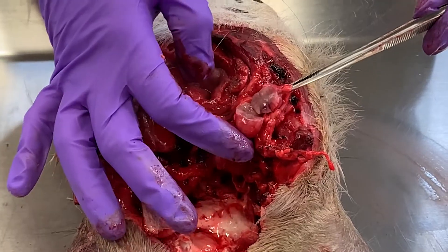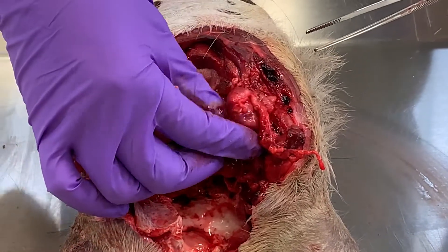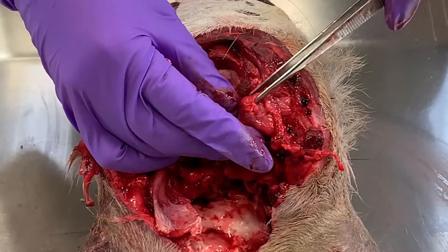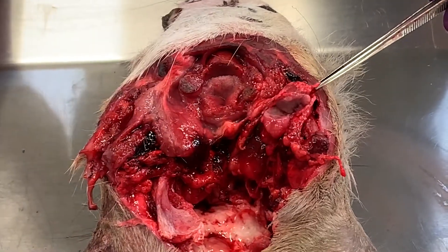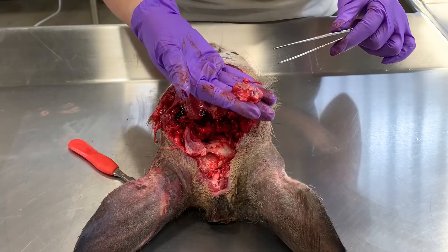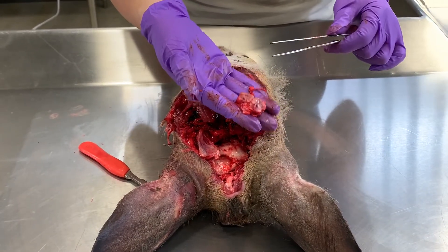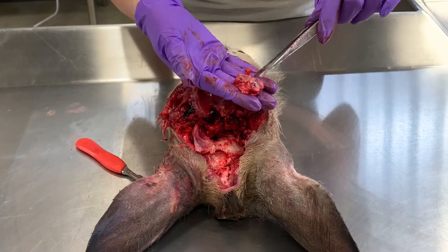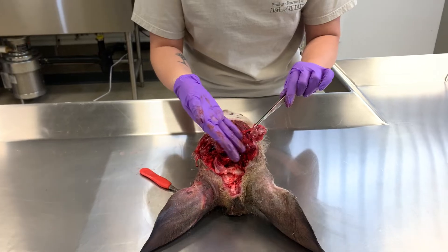The most important part is not that you keep this lymph node all together — the important part is that you get all of it. Before I cut it in half, it's kind of pea-shaped or kidney-shaped, and when I touch it, it's harder than the surrounding tissue. We'd really like to test both lymph nodes, so grabbing both is preferred, but if you can only grab one or just part of it, we'd still appreciate having that sample submitted.